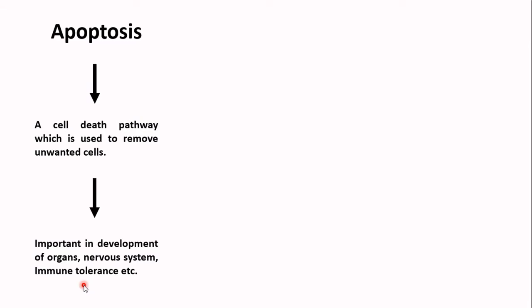But if you are a researcher studying development of cells or differentiation of cells or the effect of drugs on different cells, or you are working on a drug which you suspect can kill the cell, an anti-cancer drug, in that case you would like to detect the apoptosis in the given cell population.